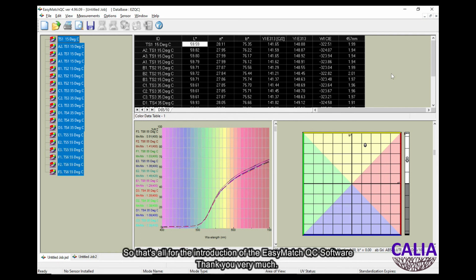So that's all on the introduction of the EasyMatch QC software.